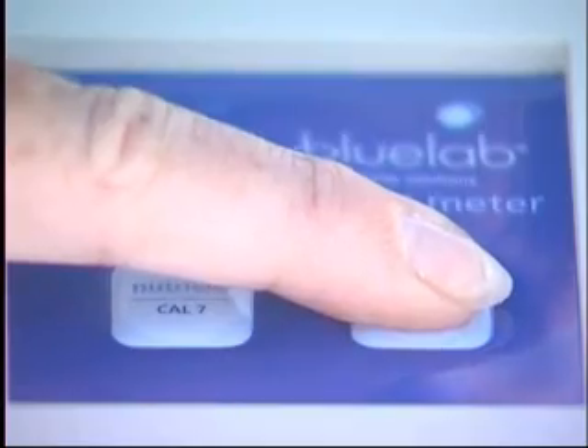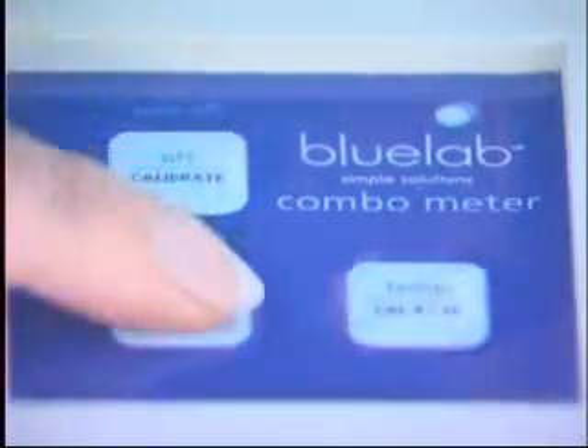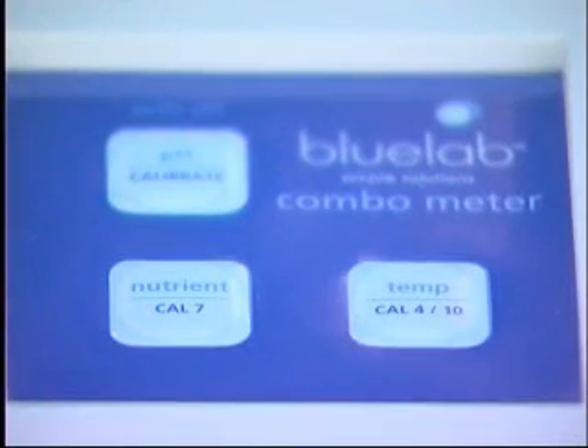If you wish to take the temperature value, simply press the temp button. If you want to take the pH value, simply press the pH button. And for the conductivity value, push the nutrient button.